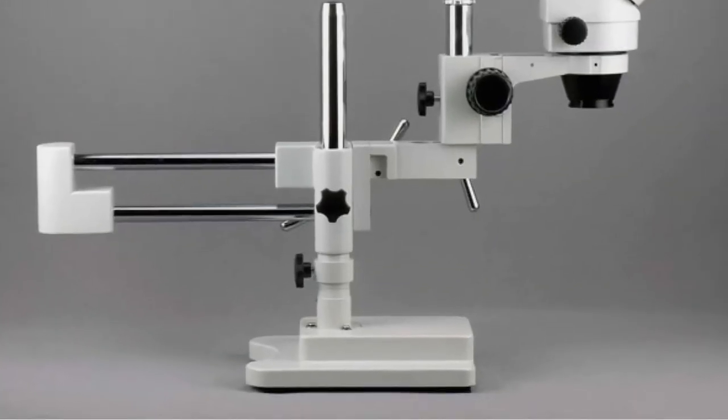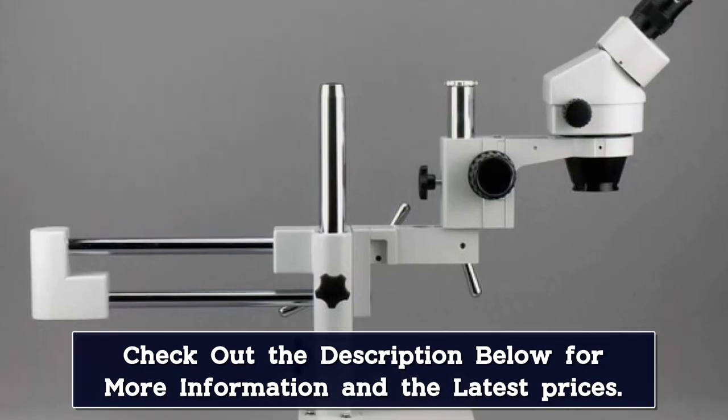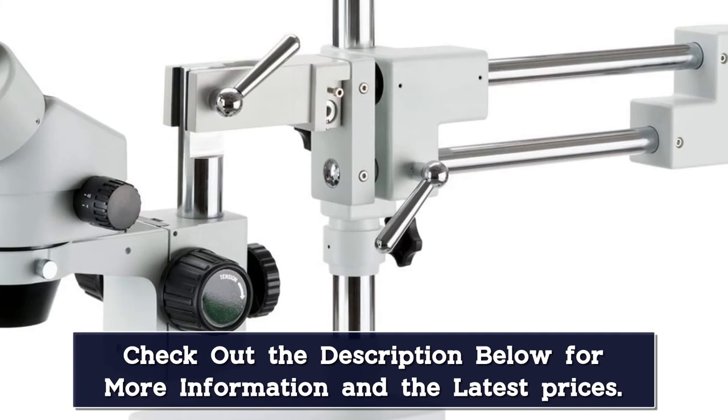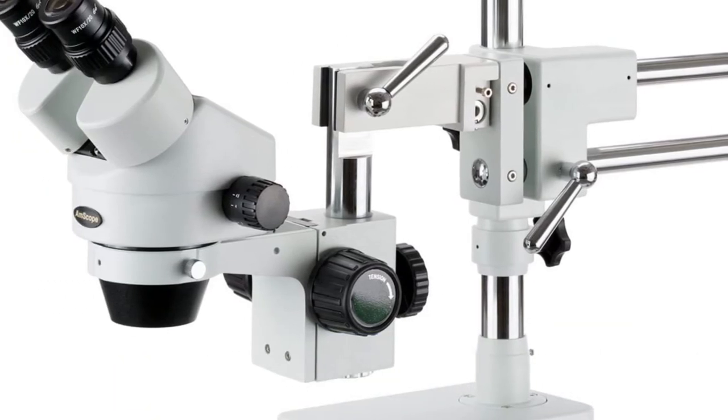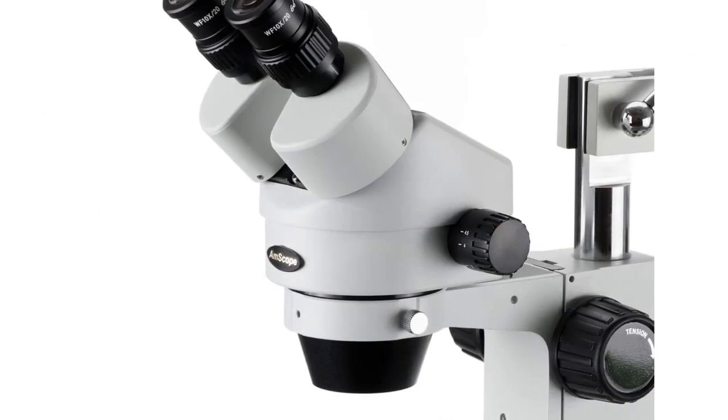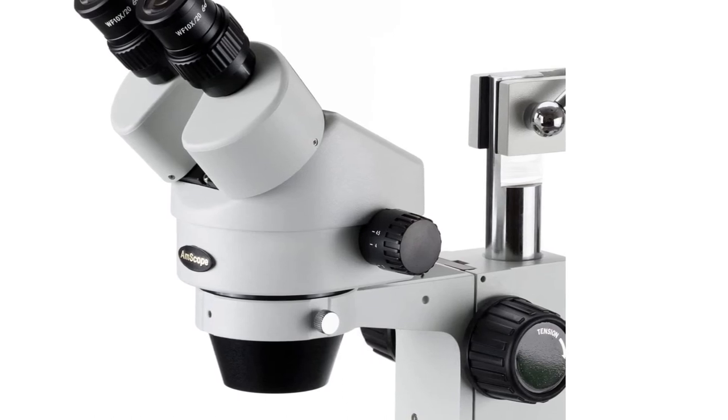Double arm boom stand has 20 inches arms and 17 inches pillar to enable users to position the microscope head on three axes: X, Y, and Z. Ambient lighting illuminates the specimen, eliminating the need for power or battery. 0.7x-4.5x zoom objective provides continuous zoom magnification and longer focal length for inspecting large-scale specimens.